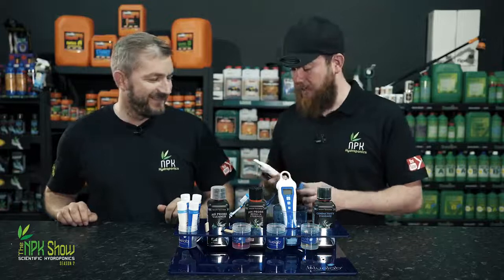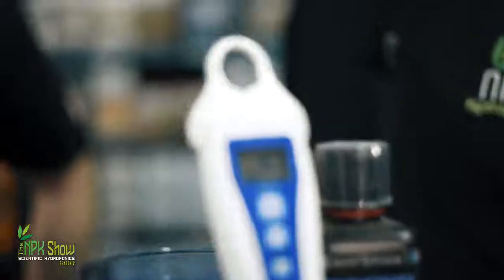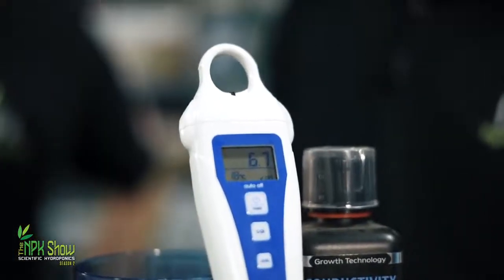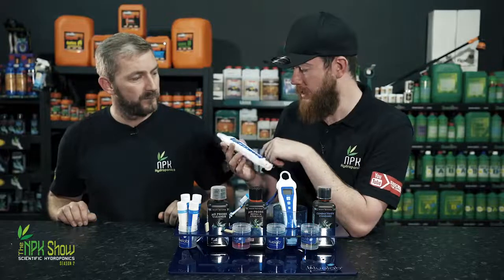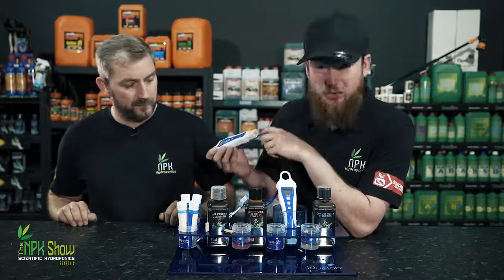Calibrating, what's the first thing that we need to do? pH 7. So your pH pen, if you use Bluelab, will have a little tick on it. That means that it's calibrated, but it doesn't come out of the box calibrated. So when you buy it from the shop, ask the shop if they wouldn't mind calibrating your pen for you. And it's really simple.